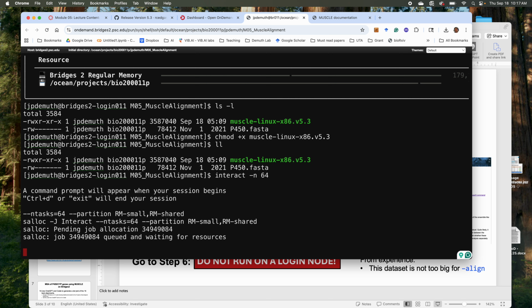Able to run the efastats command? We looked at the documentation. Do I just... except the file name won't be right. So I would just make my alignment aspects rather than... Let me see your directory.